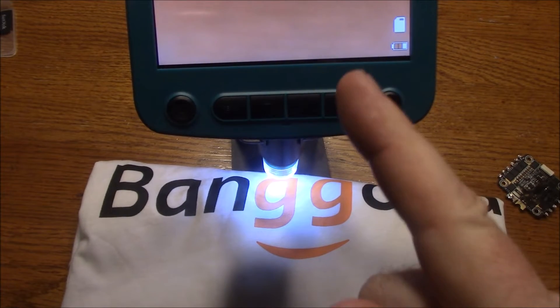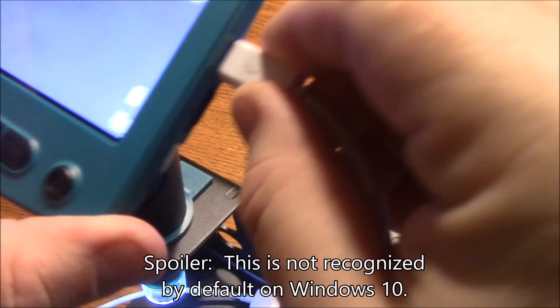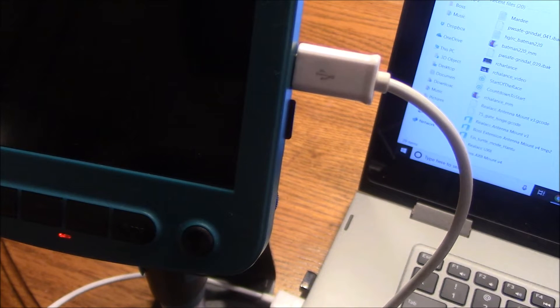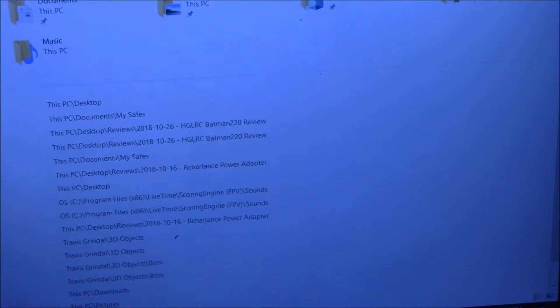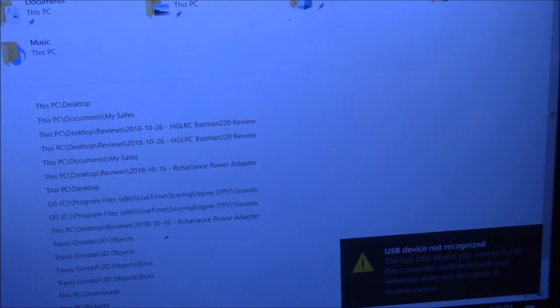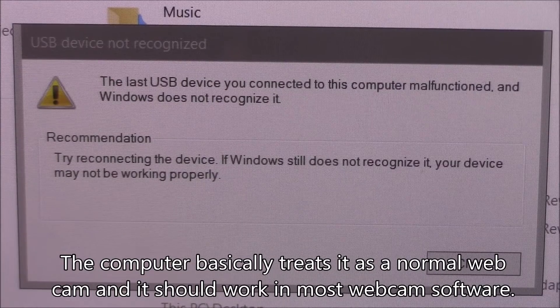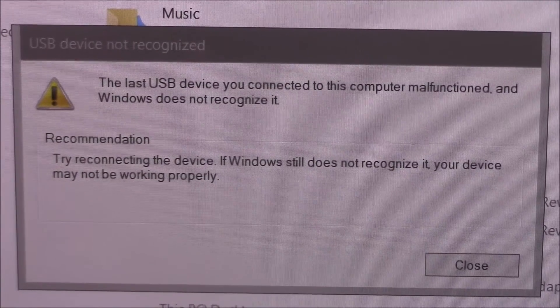I'm going to get my computer out and we'll see what this thing does when you hook it up with the USB port to a computer. I have the USB cable connected to the computer and I'm going to plug this into the screen. Now it says USB microscope but my computer is having problems recognizing the microscope without any drivers installed — this is a standard Windows 10 installation. I'm going to try to find some drivers or try to reboot first. Even after a reboot, it's still not recognizing the microscope, so it's probably missing some kind of driver.